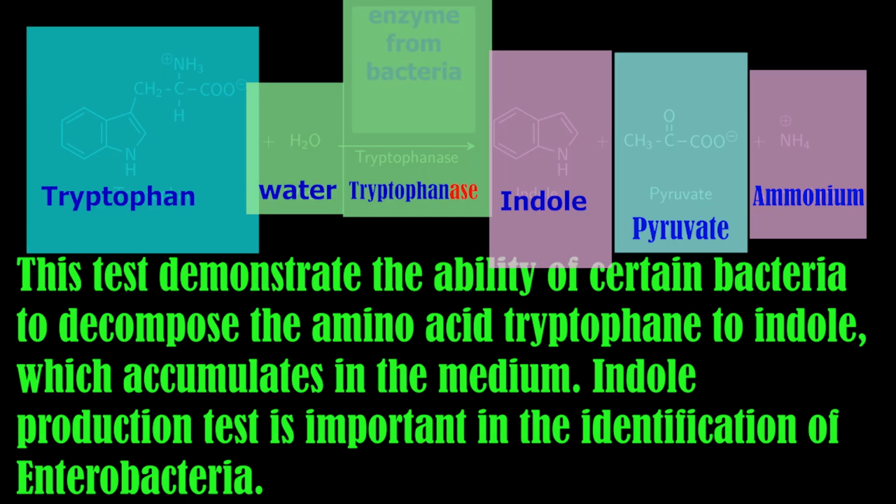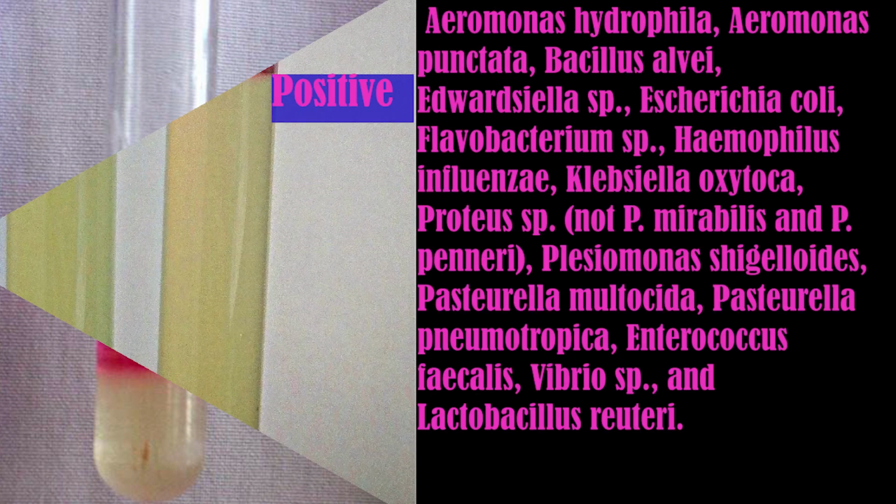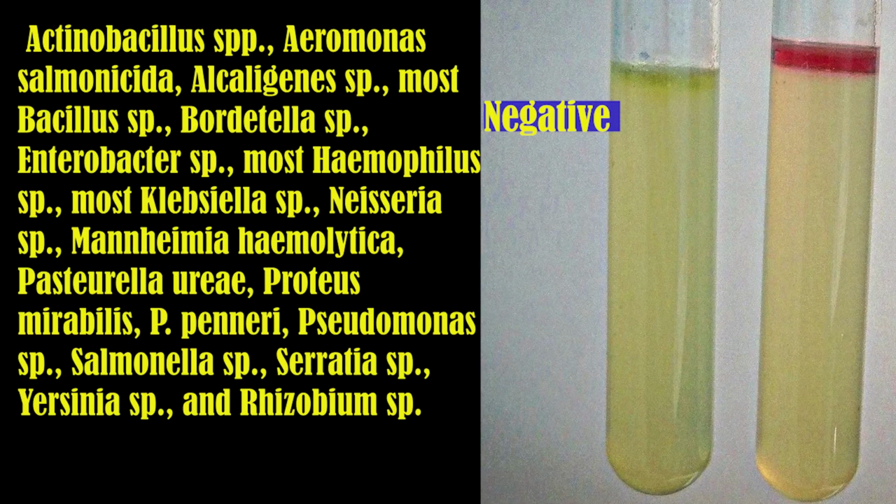Indole test. Indole is generated by reductive deamination from tryptophan via the intermediate molecule indolepyruvic acid. Tryptophanase catalyzes the deamination reaction in which the amine group of the tryptophan molecule is removed. Final products of the reaction are indole, pyruvic acid, ammonium, and energy. The indole reagent containing para-dimethylaminobenzaldehyde reacts with the indole present in the medium and forms a red rosindole dye.